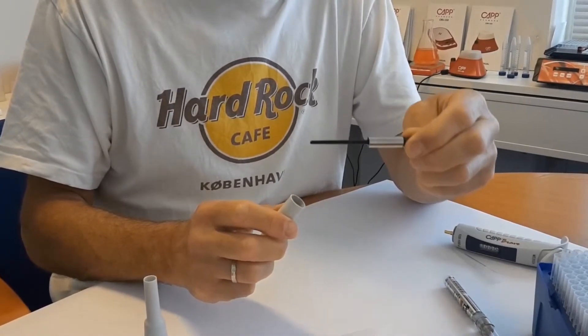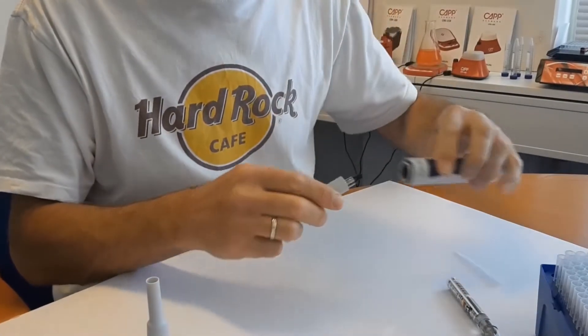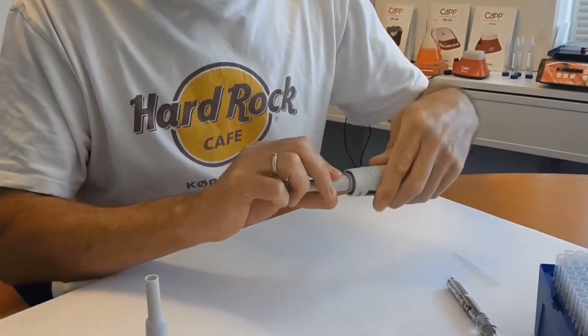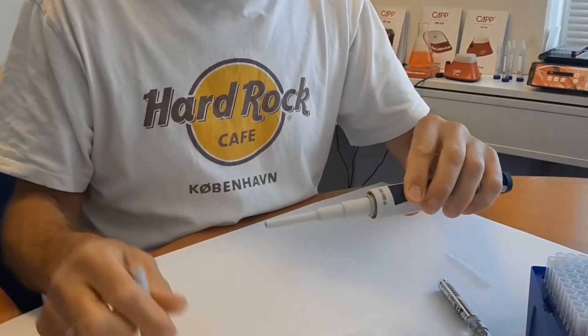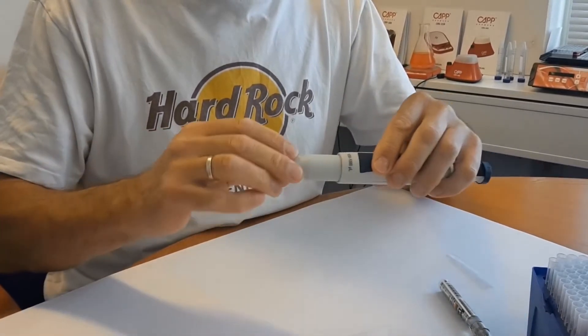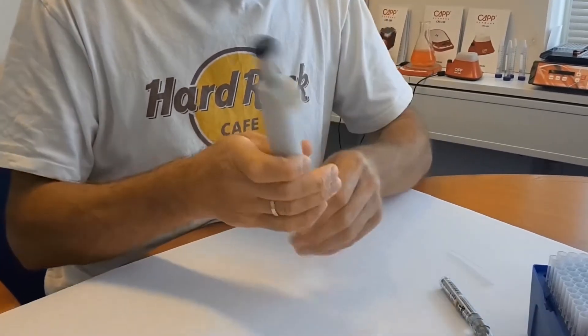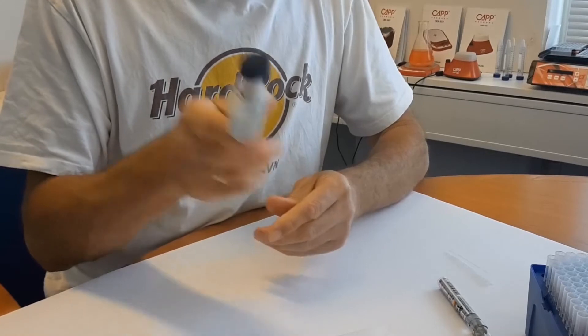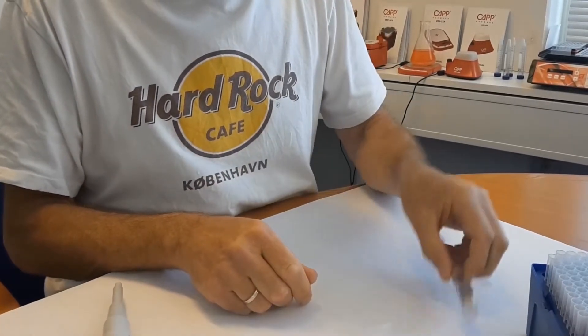You can now proceed with the reassembly of the pipette. Gently screw the tip ejector back. Contact info at cap.dk for the original piston lubricant.